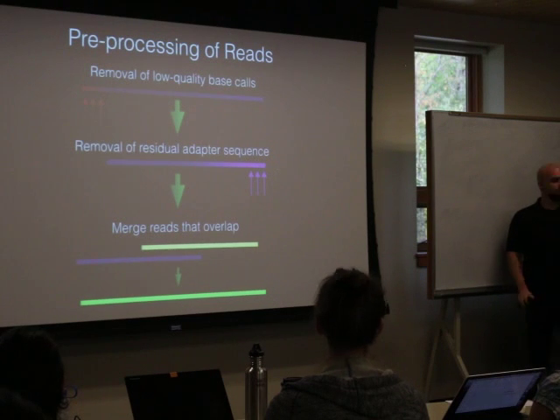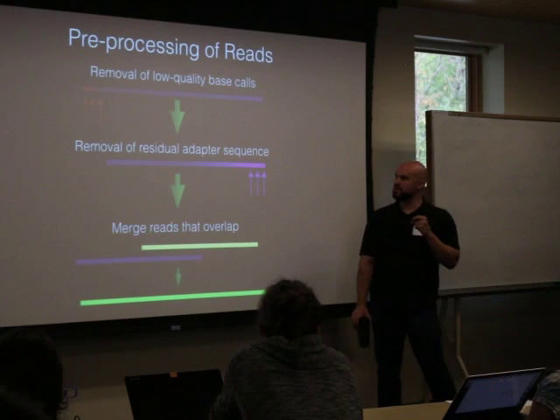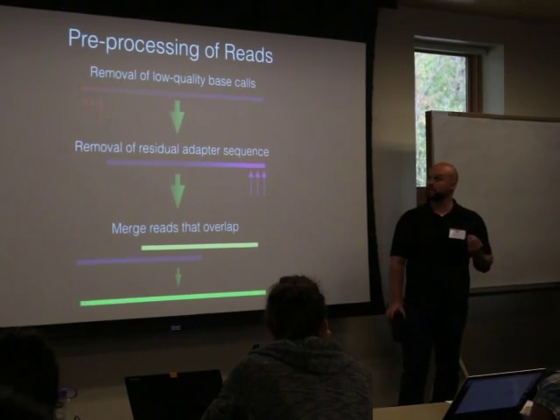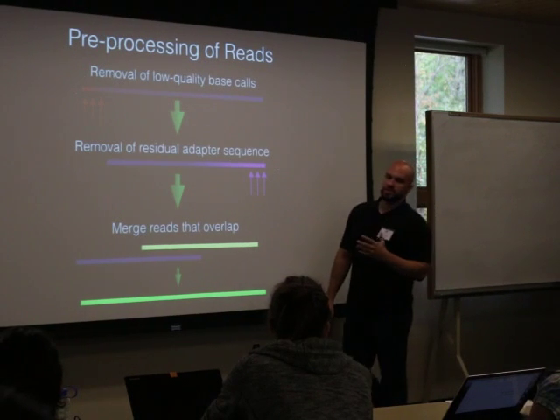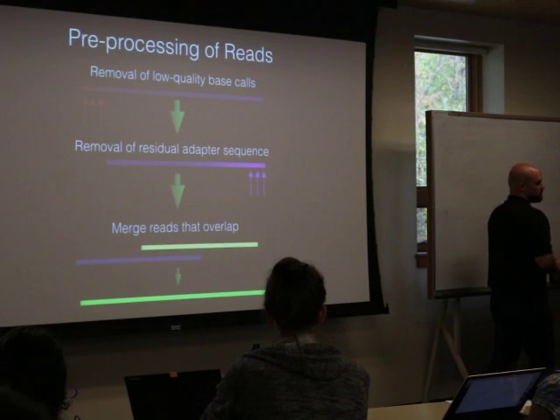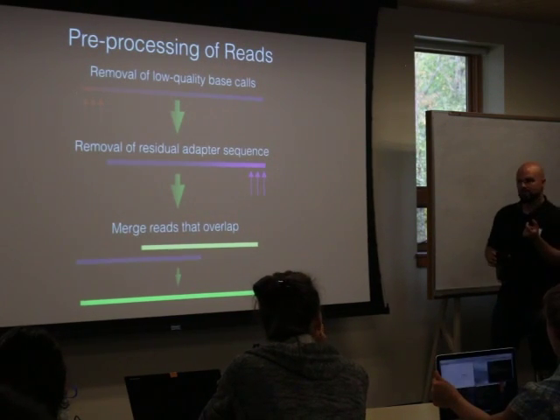Okay, and I mentioned that for this data set, I don't want to spend time doing read cleaning and everything, so the reads in there are already clean reads. And I think cleaning reads is incredibly important. I had a collaborator just a couple weeks ago who was going through and calling variants and noticed that variants were really clustered around one another.